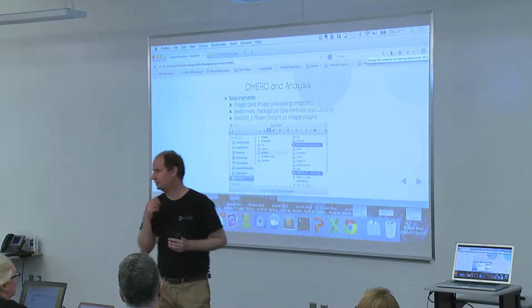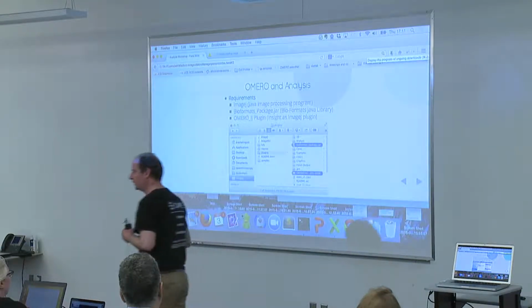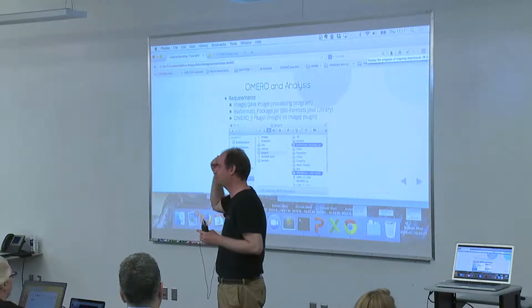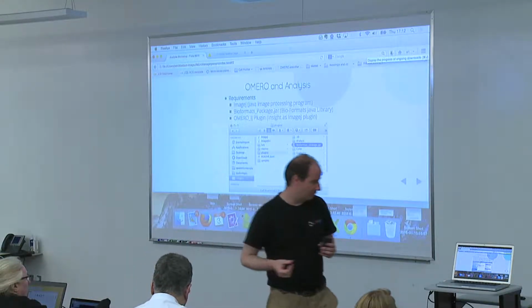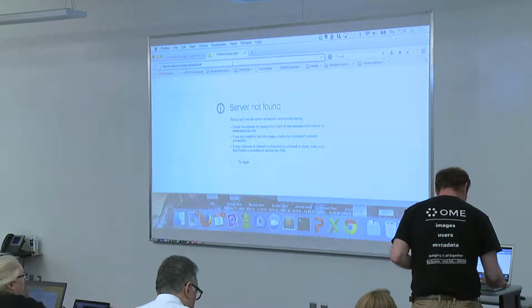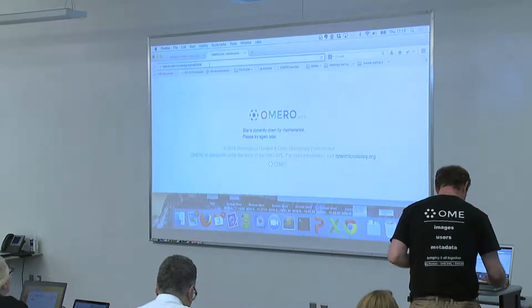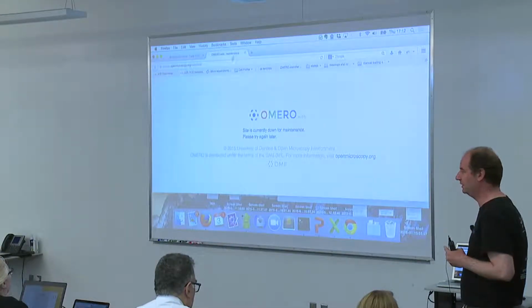It's just probably the access to the downloads page of so many people at once is not the best idea at this moment. We are not normally providing downloads pages on our servers, which we distribute. This is just to get you around the fact that I kicked you out of the normal internet. Yeah, but I can't go there myself, so that's a little bit right. So I think Dominik is trying to restart the server. Yes, we should be there in a sec.